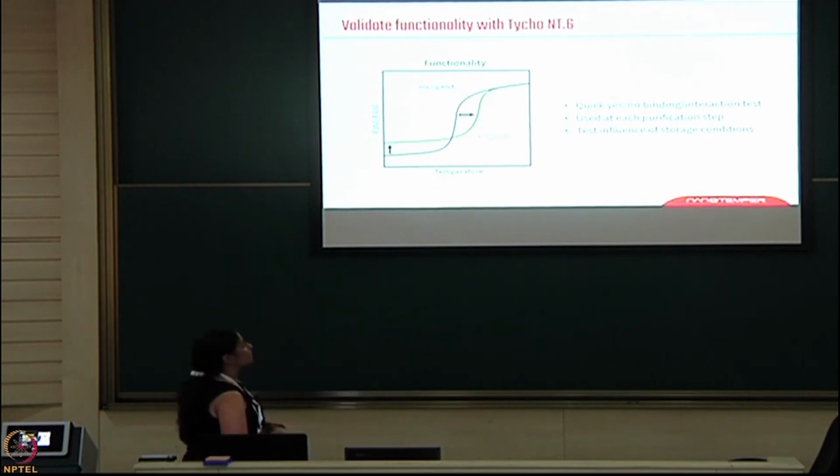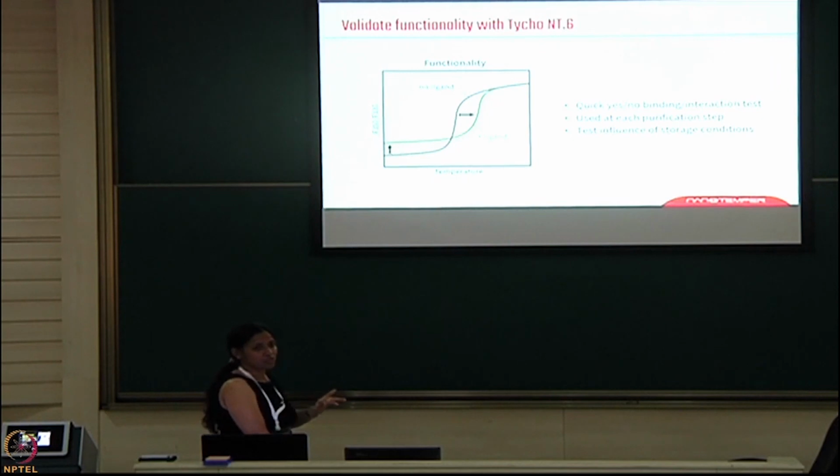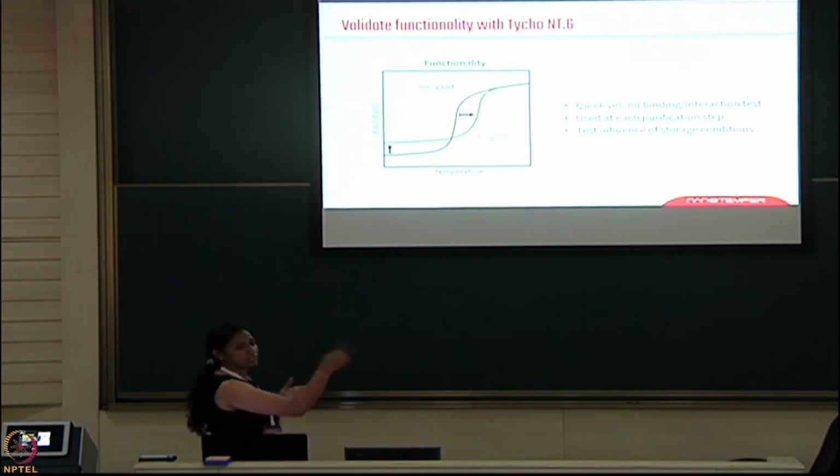Now, here you can also check the thermal shift assay. I mean, if a protein is there and you want to check whether the protein can bind with a particular ligand or not, you run the protein without the ligand and you will see a particular profile, and then in the presence of a ligand, the shift will change. The shift can either be a positive shift or a negative shift. If it is a positive shift, that means it's a true binder. If it's a negative shift, that means it's not a true binder. We can actually go for a yes or no, whether the shift is happening or not, I mean whether the interaction is possible or not. With this, you can go for further assays, like SPR or ITC, and say, okay, this protein with this ligand is good because there is the thermal shift, because the TIs are shifting here.